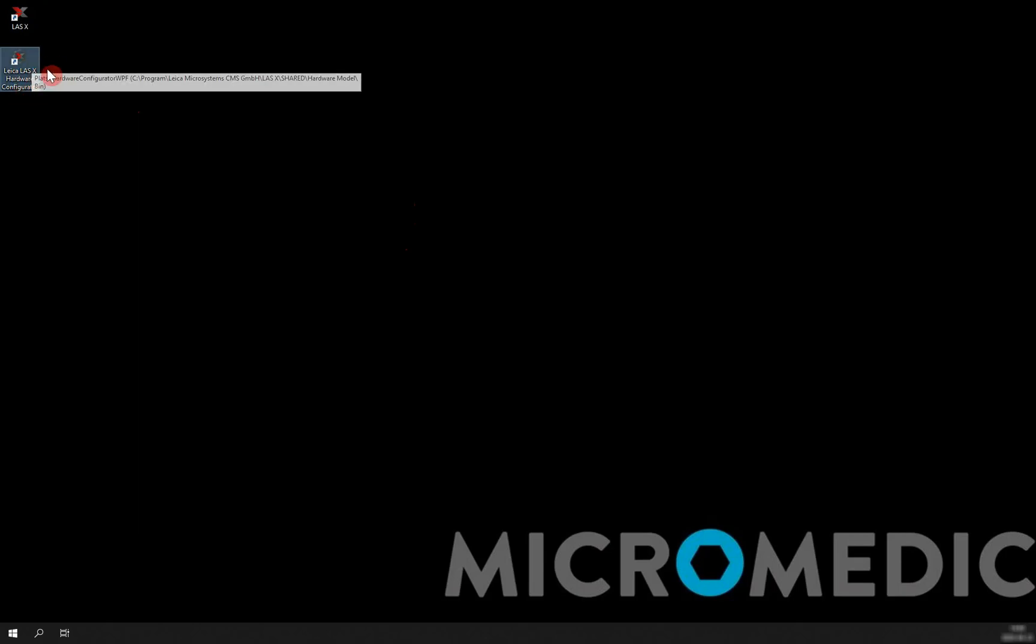Once we have installed the LES-X application, we need to tell the software what hardware is connected to the camera.